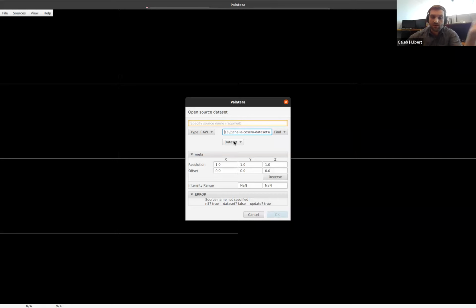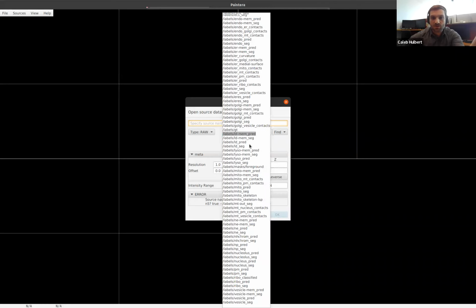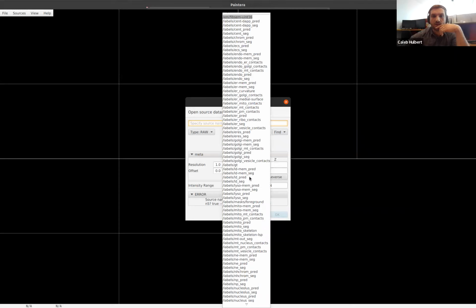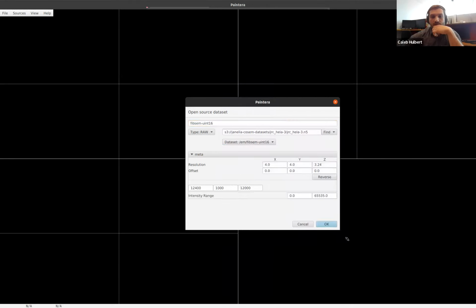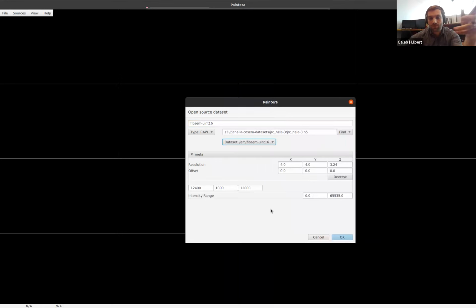And this one also happens to have a lot of data sets. So you'll see when I open this, it just parses a ton of data sets. So one of the things we can do, we can open this. This is some raw data, and it properly parses this metadata because we support the metadata type that this uses. So we can open this. Now this is one that's remote.